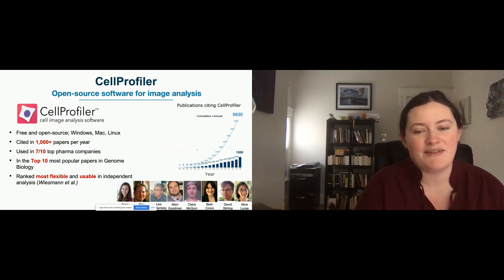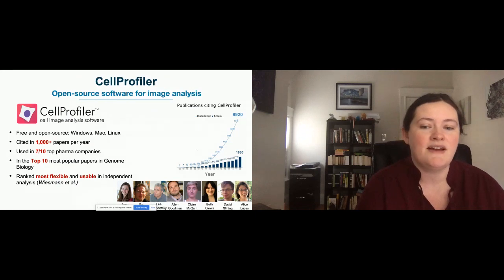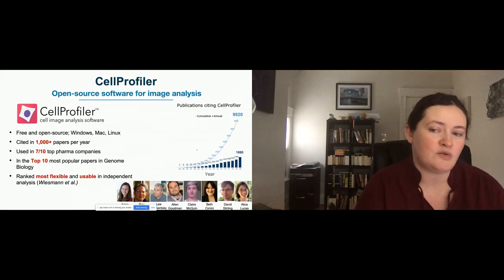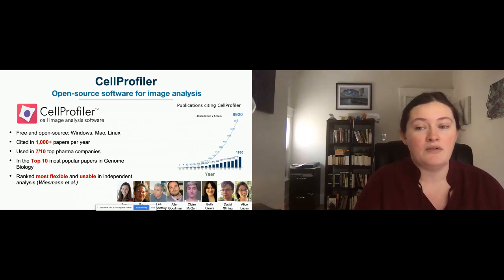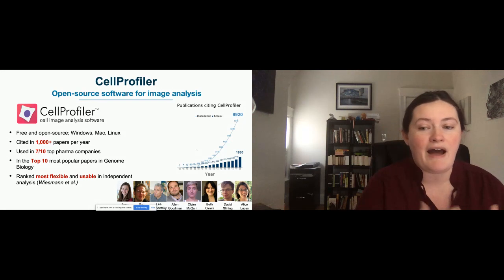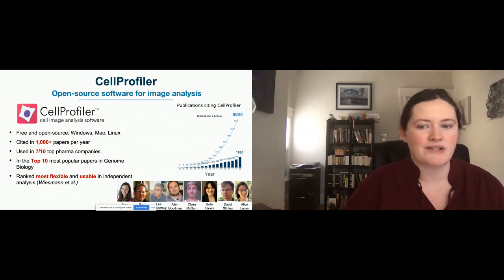There are several, you can't tell from this image, but also what's, I think, a little special about CellProfiler is about half of the people that I've shown here are wet lab trained biologists, and about half of them are professional software engineers. We've basically always had at least one of each working on the tool, which means we have the benefit of trained software engineers who actually know what they're doing and help us write great code, and wet lab biologists like myself who understand really how biologists think, what are the kinds of assays biologists want to do, and help figure out how we can bridge the divide between those two communities, which often have very different sets of language and ways that we talk about problems.